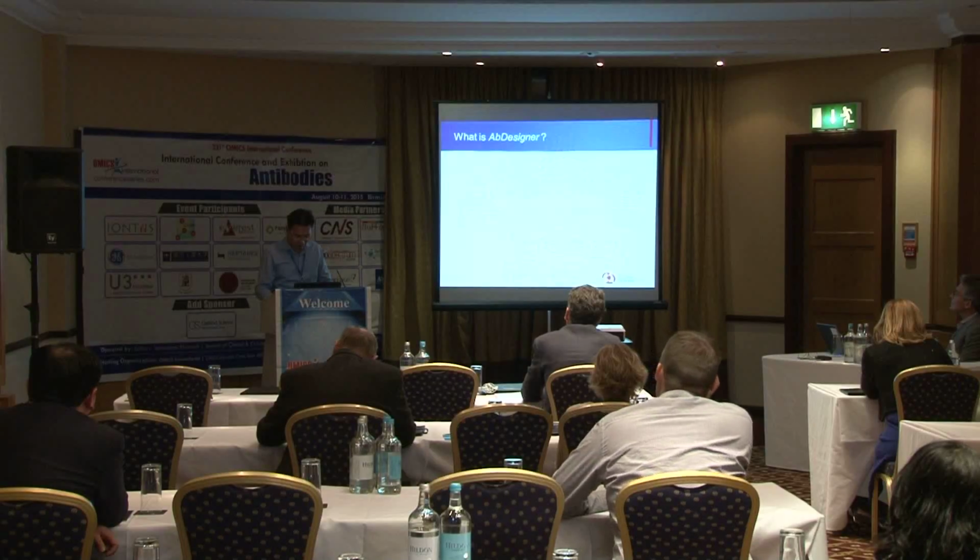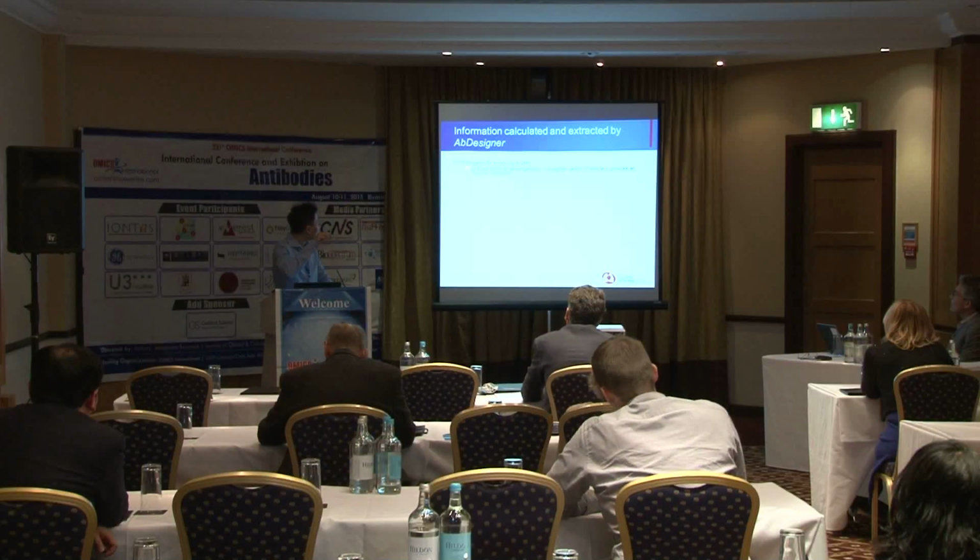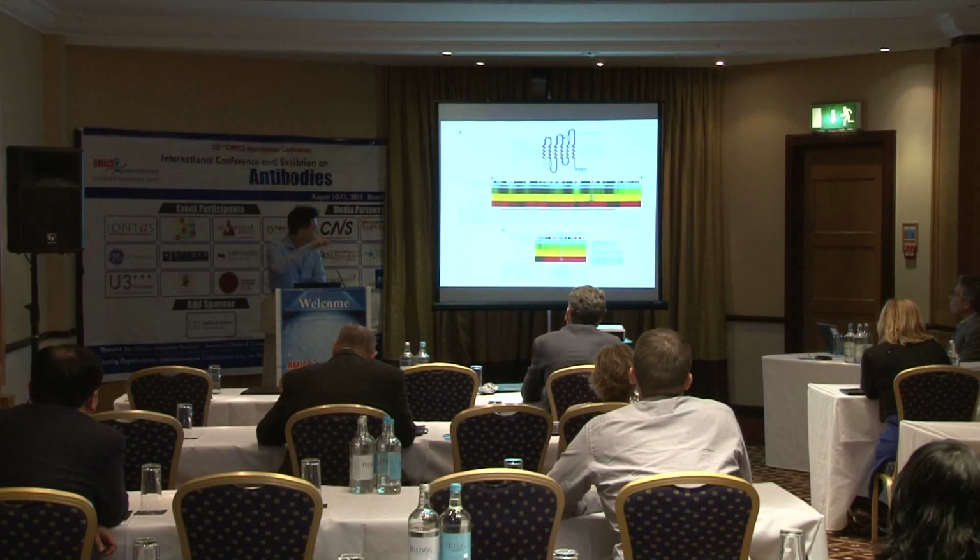It will calculate the immunogenicity score, which predicts how likely your peptide is to stick out, or more like hydrophilicity. It shows up here in the green bar.